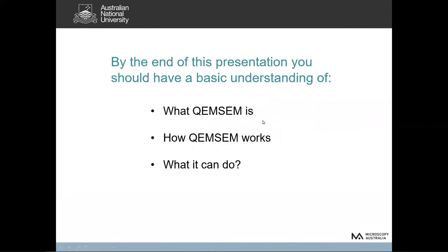So by the end of this presentation, you should have at least a basic understanding of what I mean by a QEM scan, how it works, and also a little bit more about what it can do.